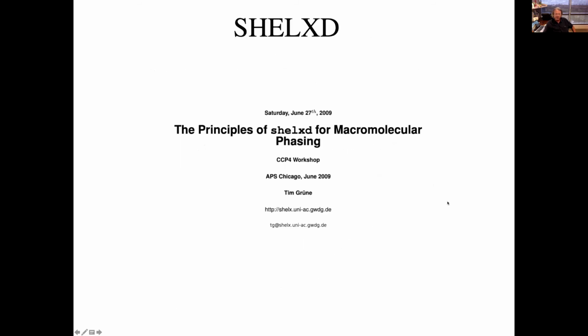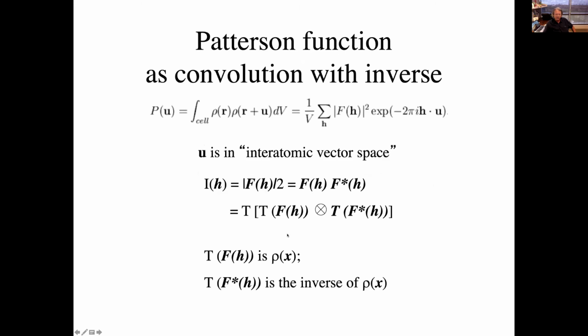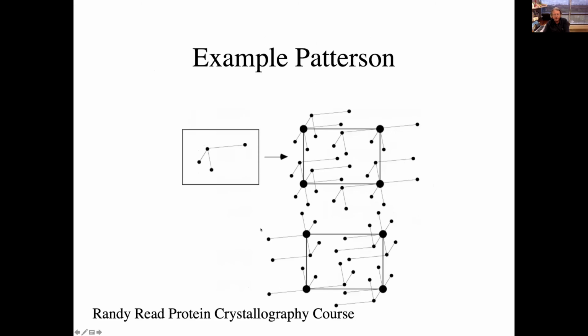And there's something called the convolution theorem, which explains why this squaring is equal to this convolution, and vice versa. That's a very useful way for crystallographers to go very easily back from real to reciprocal space when you need a simple multiplicative function. So let me illustrate an example Patterson map.